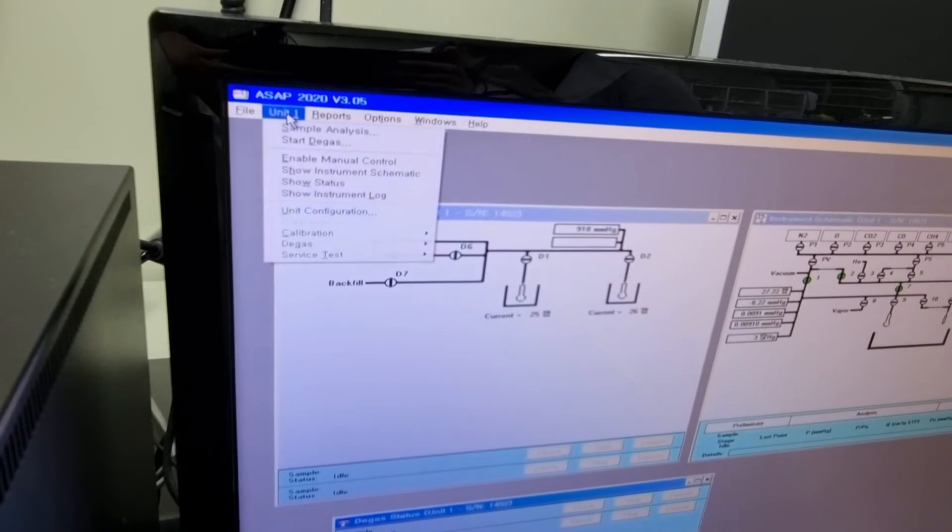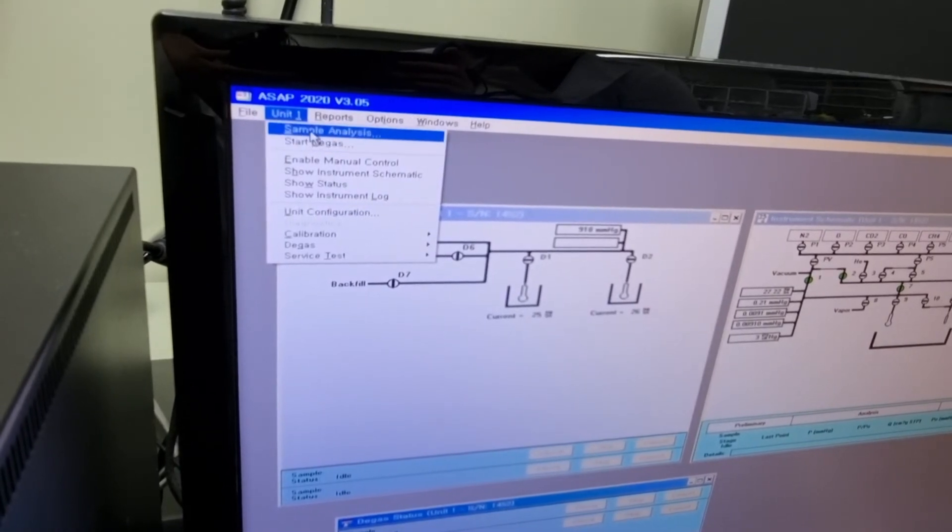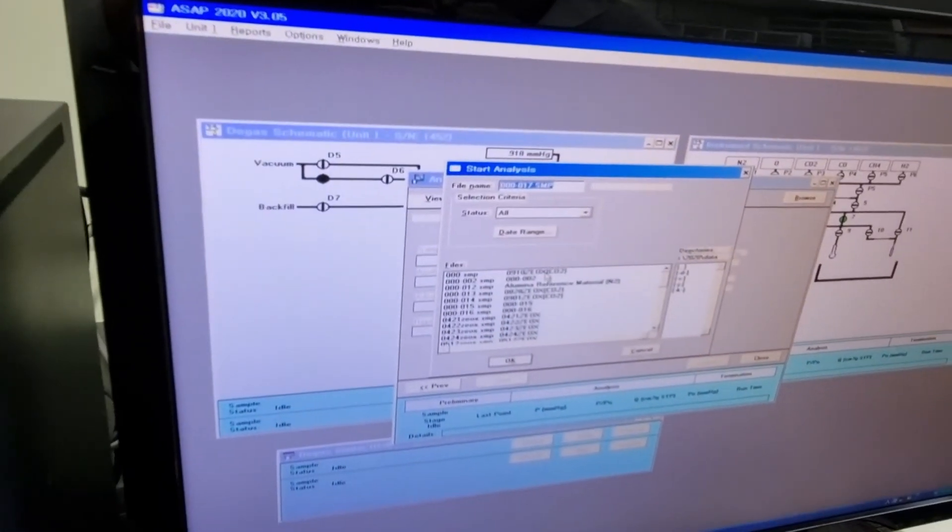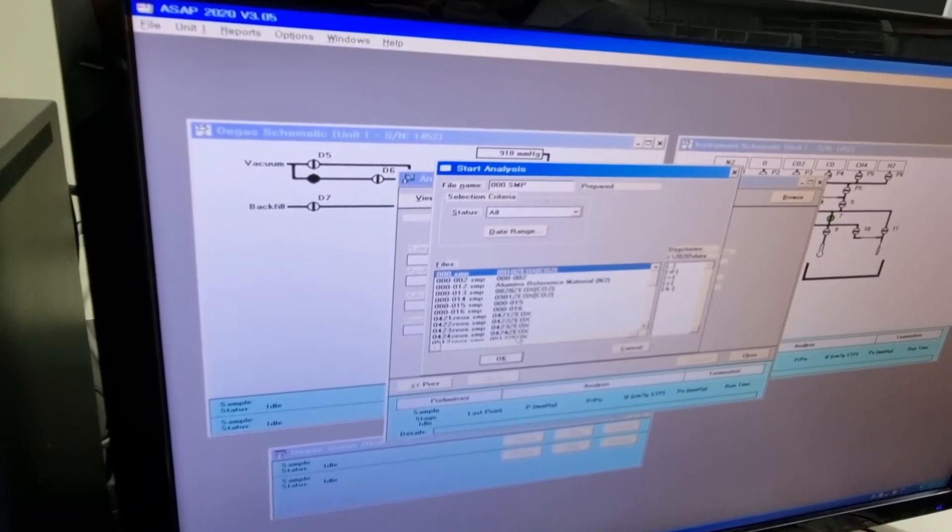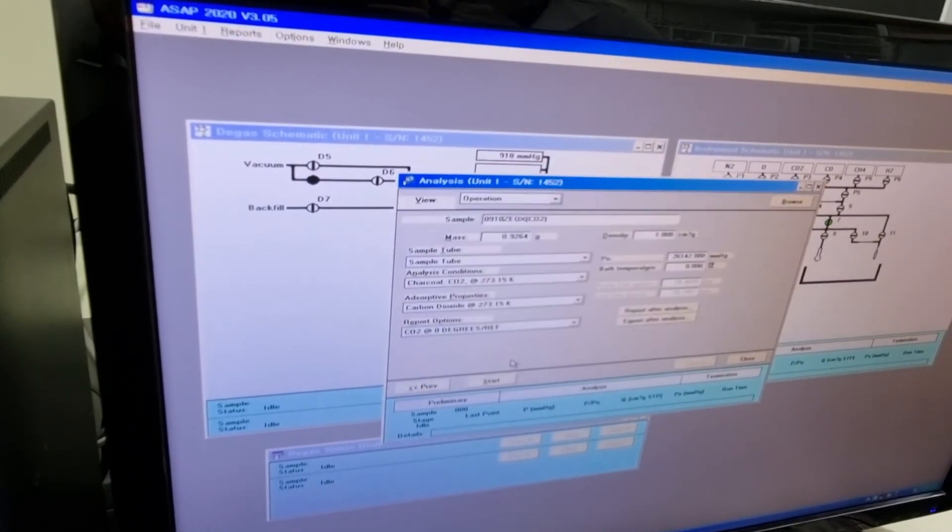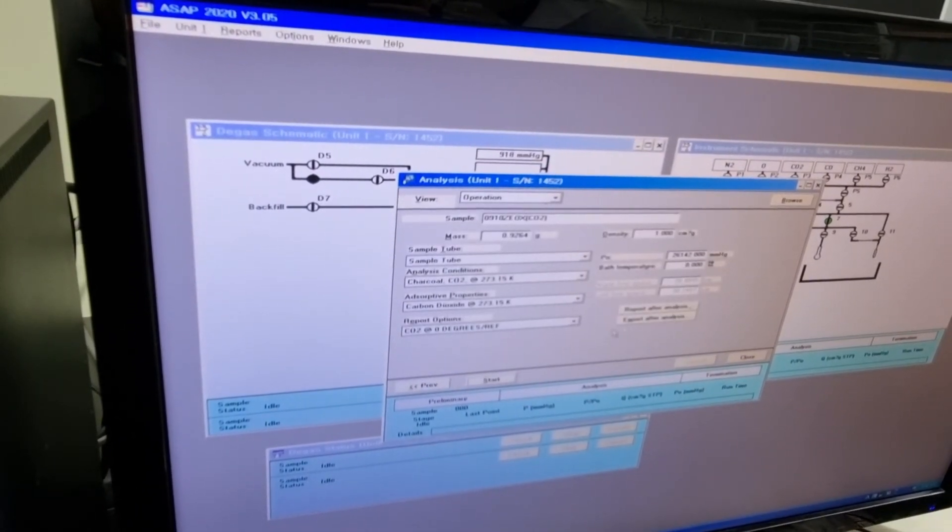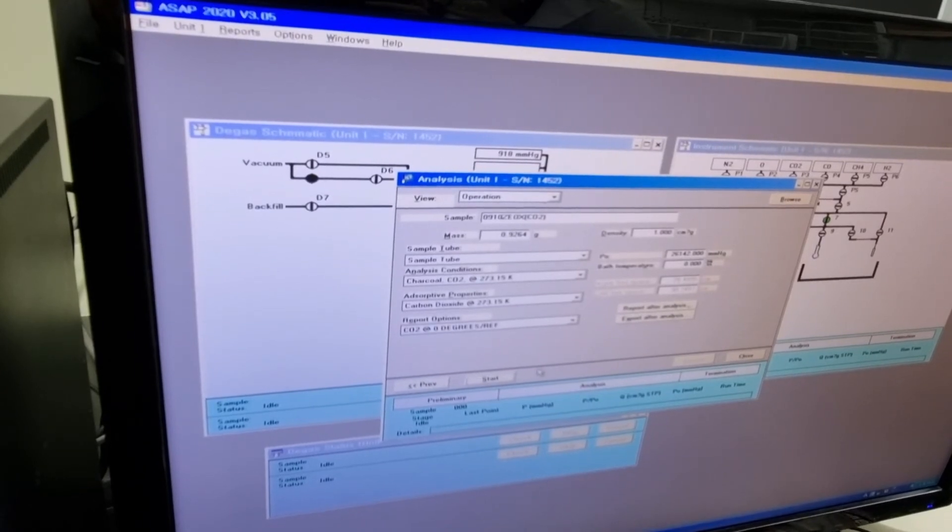Start the analysis. You can go into unit 1, sample analysis, and click what you made for your information file. Check one more time about your condition and data.